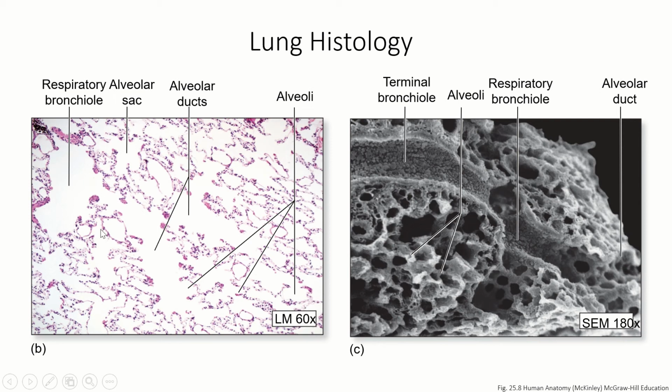It's mostly air. Sometimes people get it confused with adipose tissue, which I can kind of see. But notice that here we see lots and lots of nuclei around each of these circles. This obviously isn't an adipocyte. Remember, an adipocyte is a single cell that's round. And when we look at adipose tissue, we see lots of distinct cells next to each other.